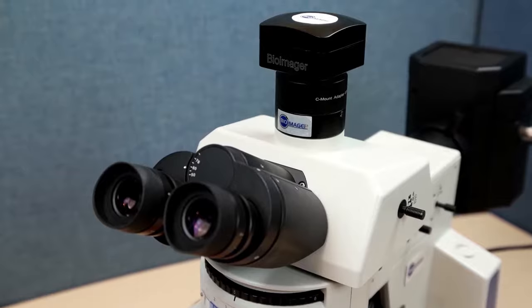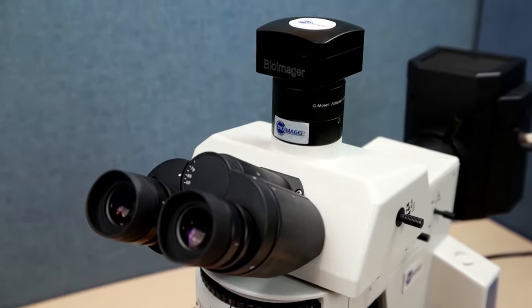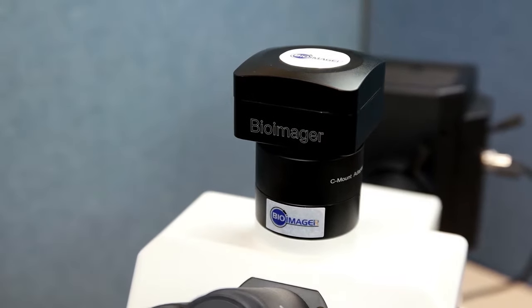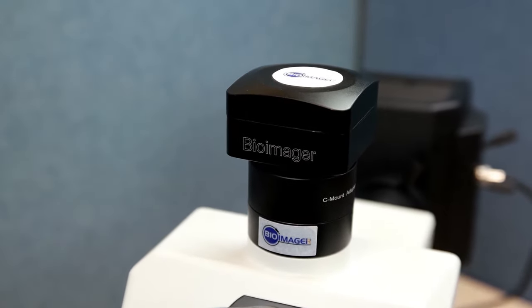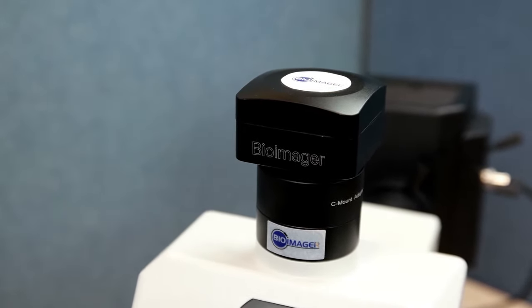This microscope has a great trinocular viewing head. You can install a camera at the top using different C-mount adapters such as 0.35x, 0.5x, 0.6x, 1x, and even 1.2x.